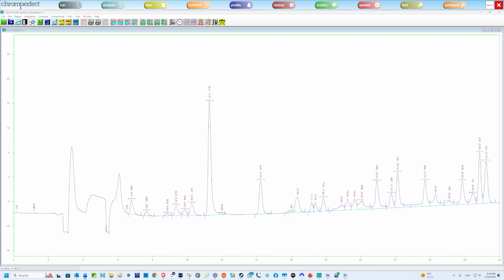When a chromatogram is displayed in the Analyze program, it appears as a plot with retention time along the horizontal axis and detector response along the vertical axis. The plot represents the detector signal that was recorded during the acquisition of the sample. The first set of tools we will explore are the basic plot navigation controls.